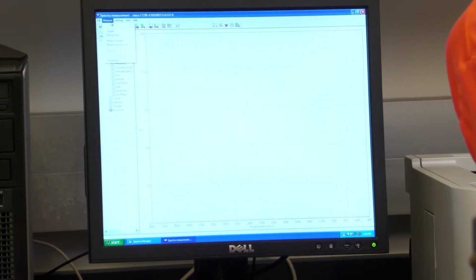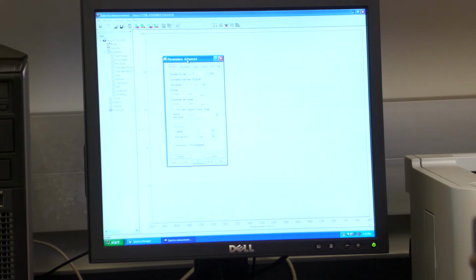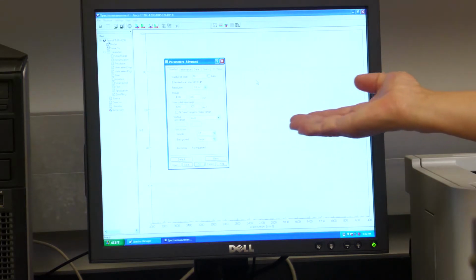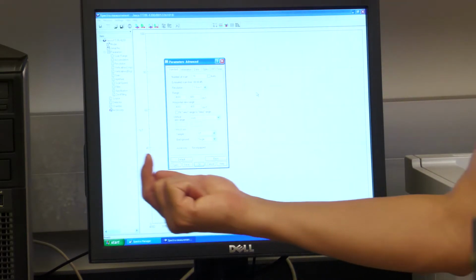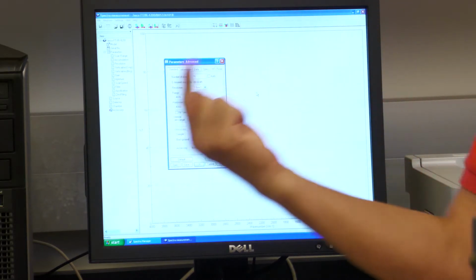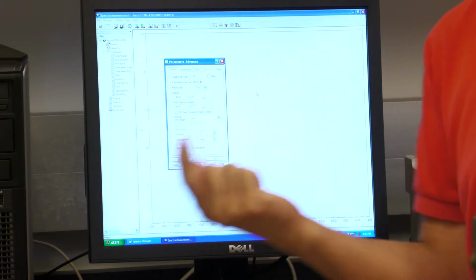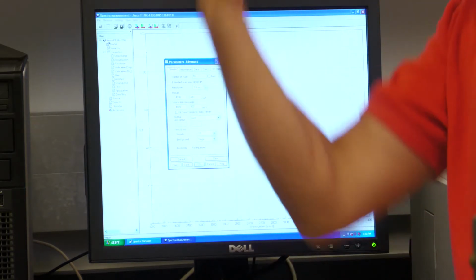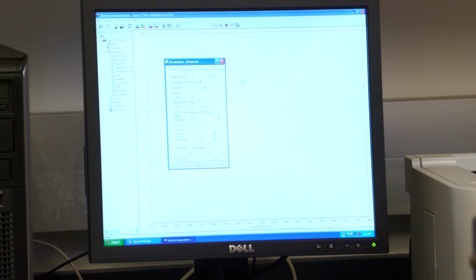Now let me tell you what parameters we use. This is a major parameter we use, okay? The key point is here, everything is here. The first one is called number of scans. We scan 16 times. So that means you do it 16 times and we add them up to increase the signal to noise ratio. Because the signal keeps adding up, right? Noise is random, so it will cancel. So we do 16 times.